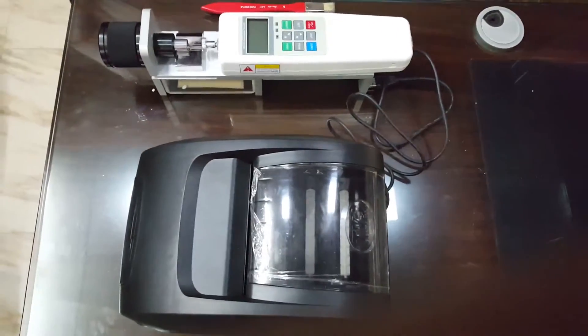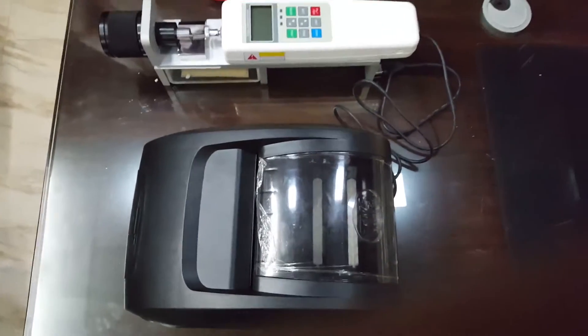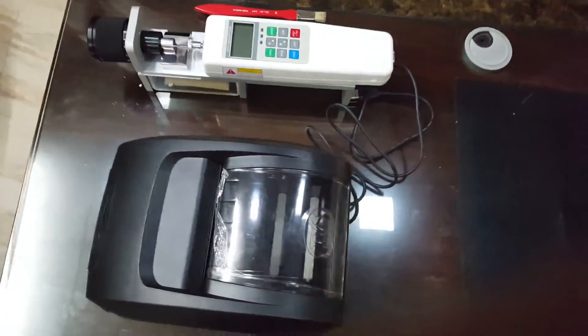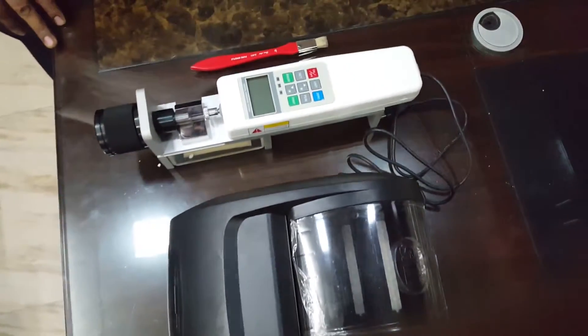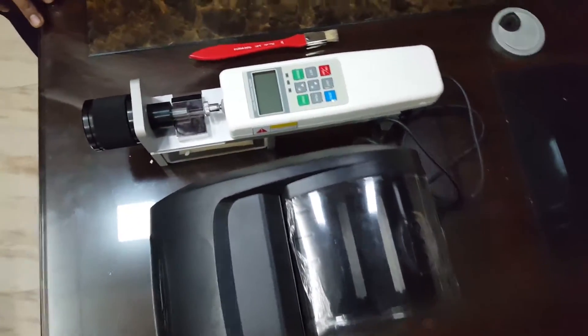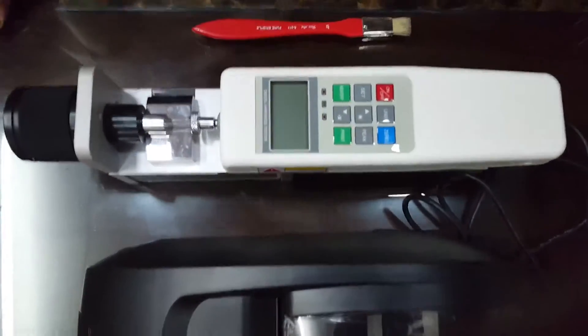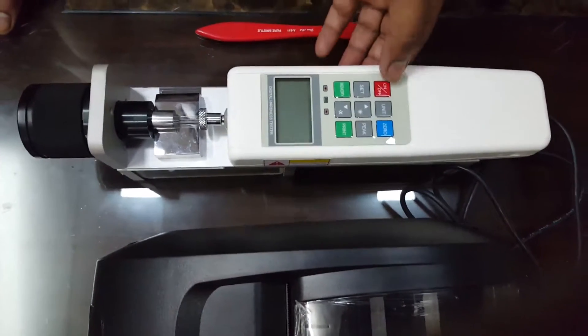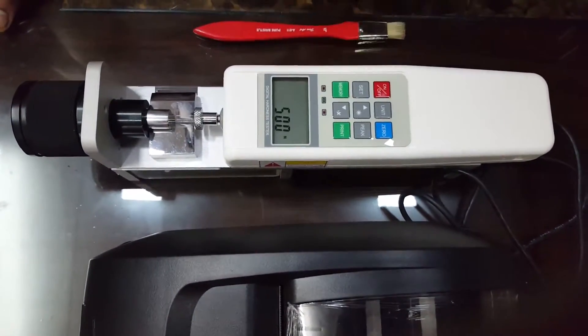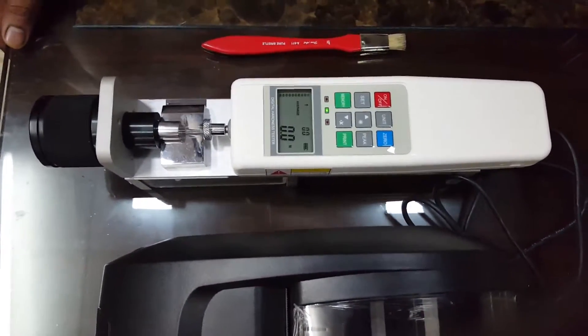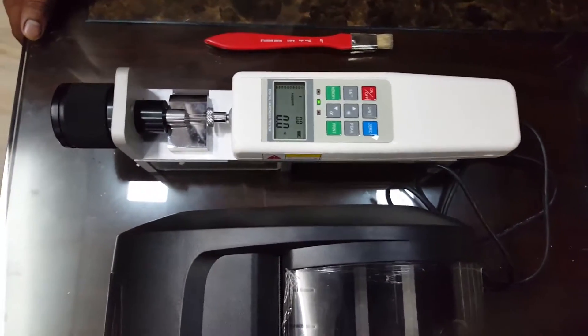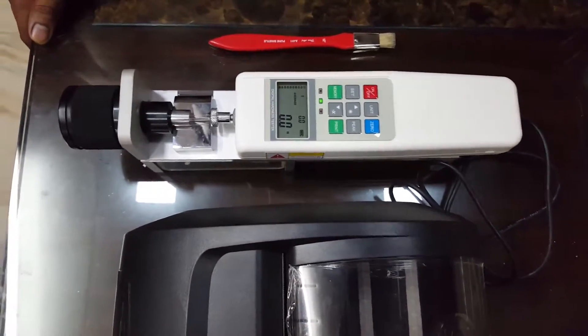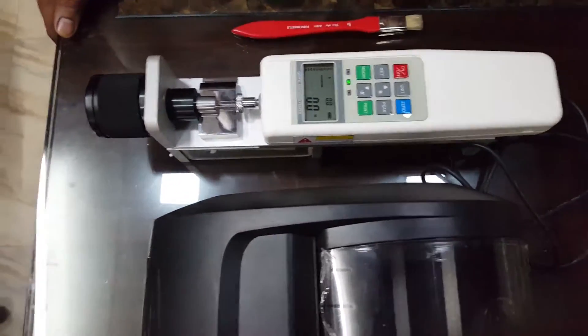This is a digital hardness tester with or without printer. Now we'll explain the features of the hardness tester. Press the on button to switch on the system. This system can be operated on battery as well as mains.